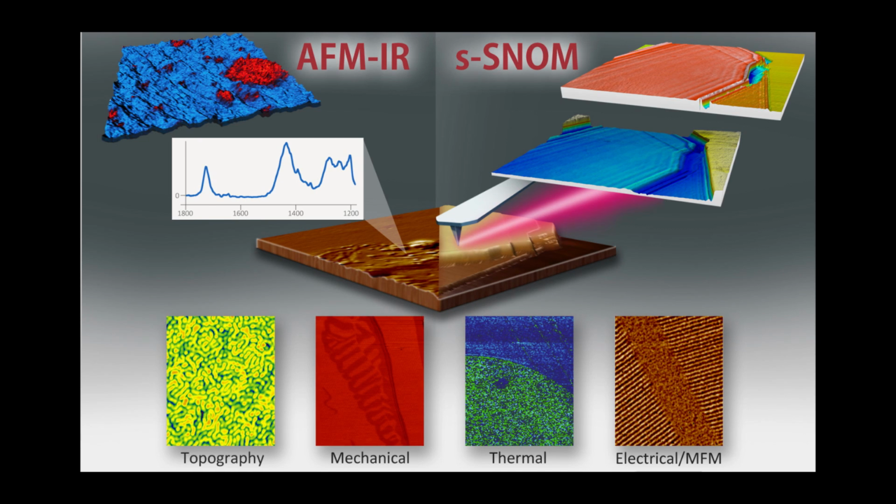Actually, both of the lasers that we have in the CH range, both the new resonance enhanced one and our older one, tune out to 4,000 inverse centimeters or 2.5 microns. There are typically not a lot of absorption bands above 3,600, so we typically limit it to 3,600. But if there is an application where you need to get out to 4,000, you can certainly talk to us about it.